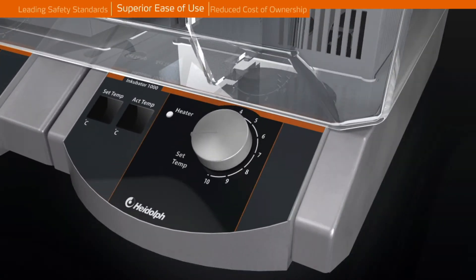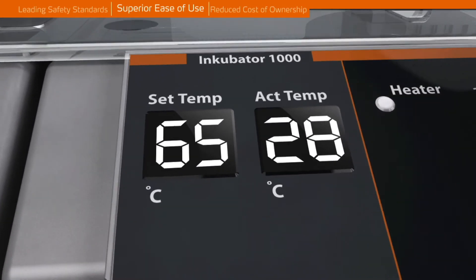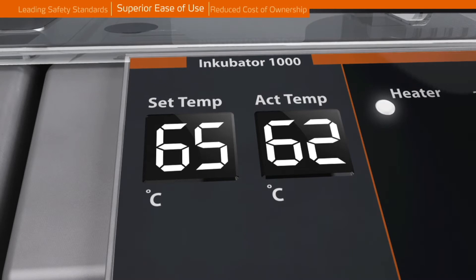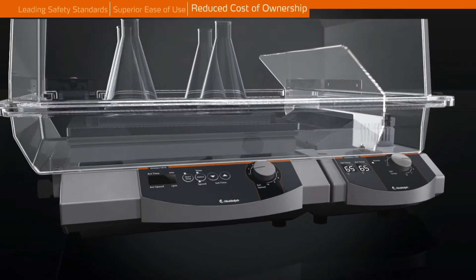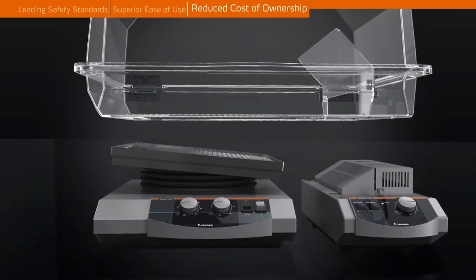Digital temperature settings up to 65°C with a separate display for actual temperature. Use one incubator for numerous shakers — interchangeability is ensured and takes less than 2 minutes. You can incubate and mix simultaneously or independently.